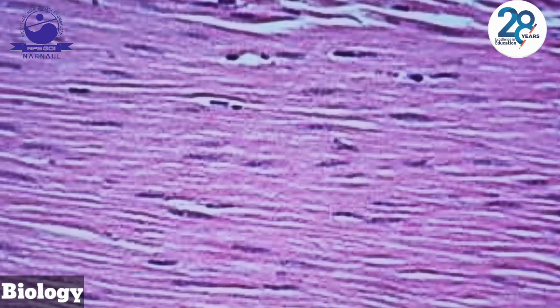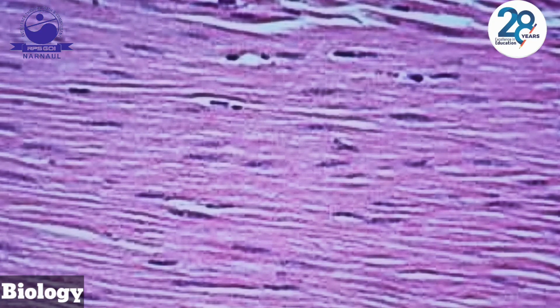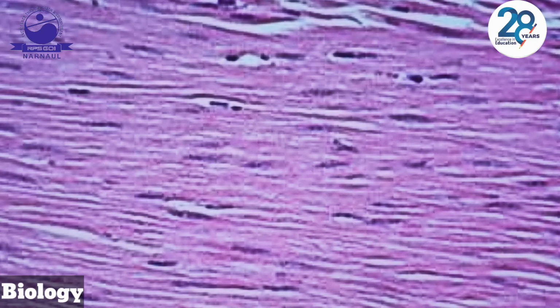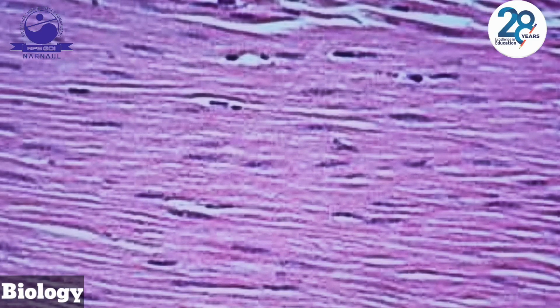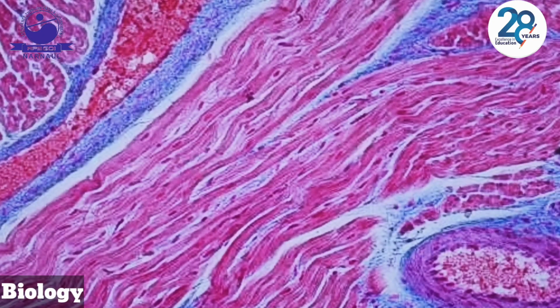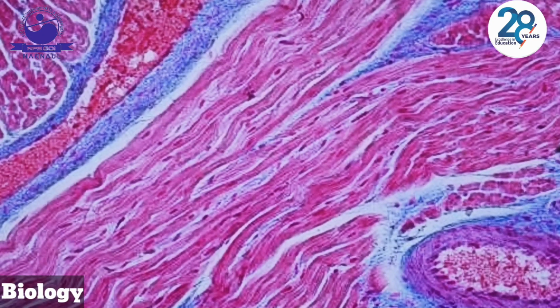My dear students, this is the smooth muscle. Cells are cylindrical, unbranched. They are involuntary muscles, they contract slowly and do not undergo fatigue, or we can say they get fatigued very little. Next one is very important, cardiac muscles. Cells are cylindrical and branched.